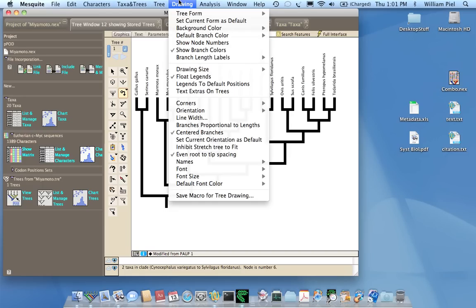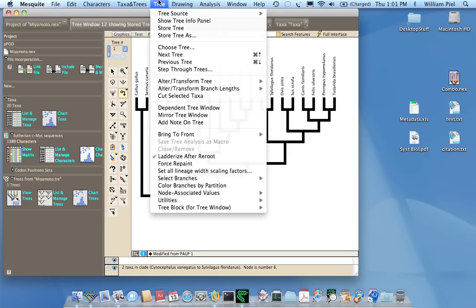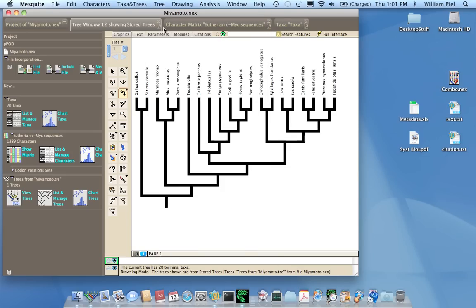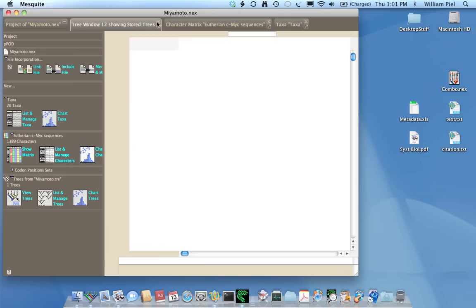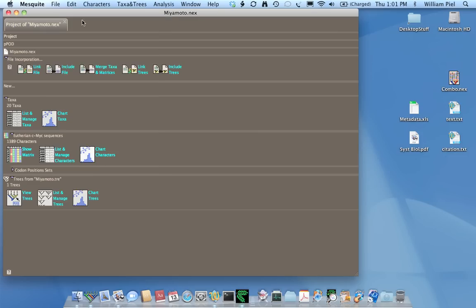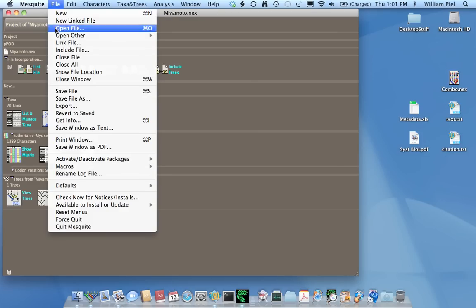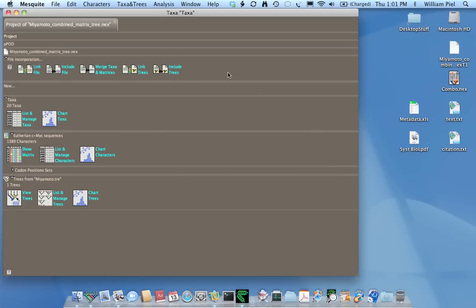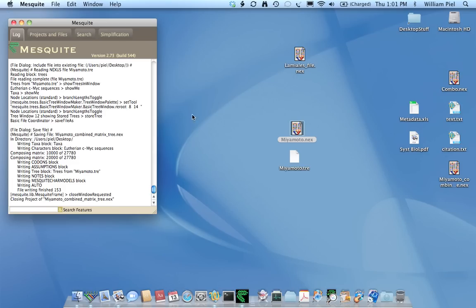But before I save the Nexus file, I need to go to the Tree menu and do Store Tree. Otherwise the changes made to the rooting of the tree will not be saved. So now that I've stored that tree, I can now do save and I'll give this a new name. Miyamoto Combined Matrix Tree, and this file is now ready to upload to TreeBase.